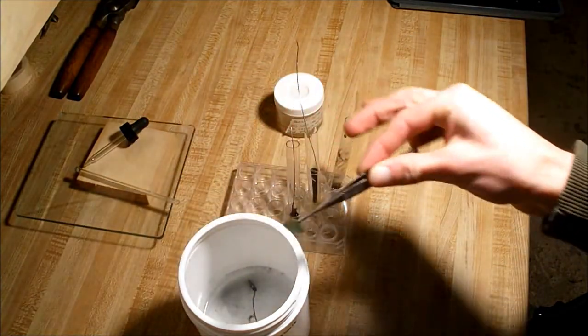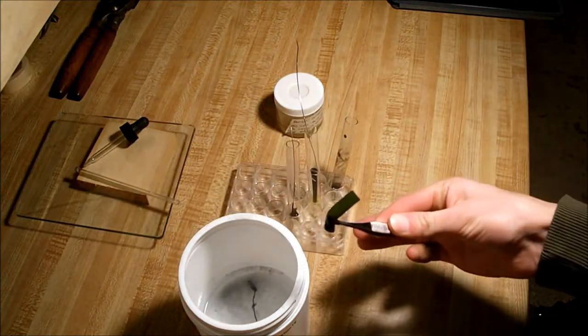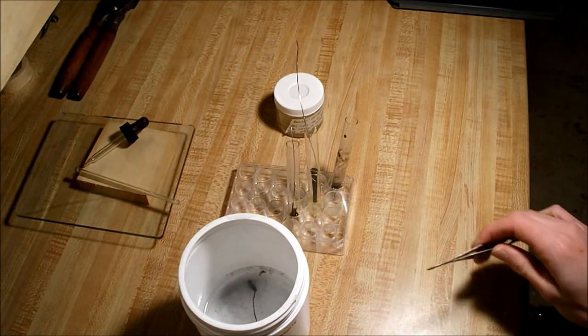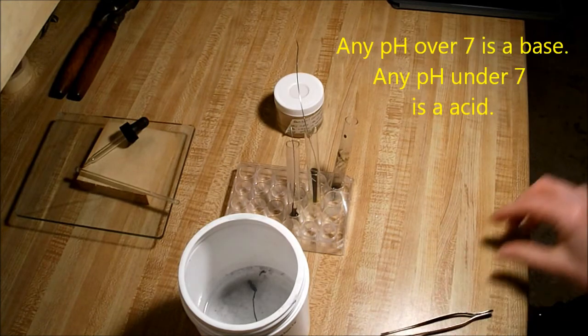As you can see, it's turned a nice olive green, which means it's, with this brand of pH paper, which means it has a pH of about eight and a half, nine, maybe nine and a half.